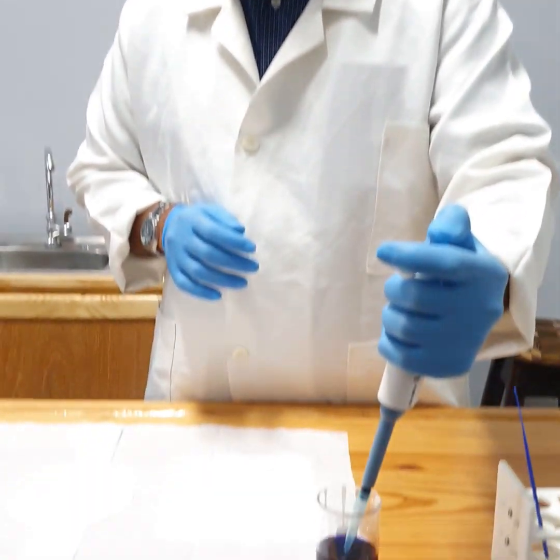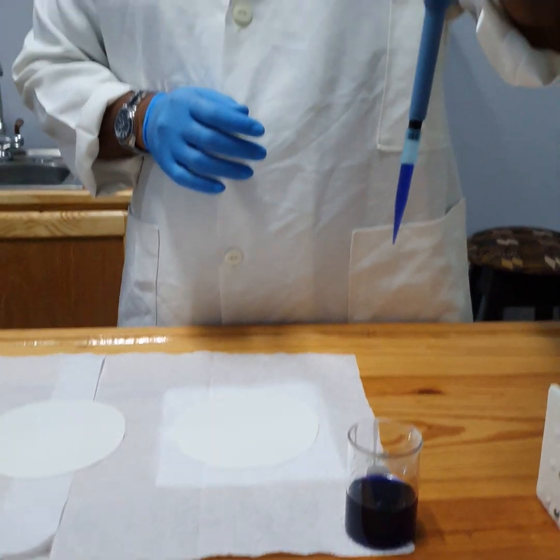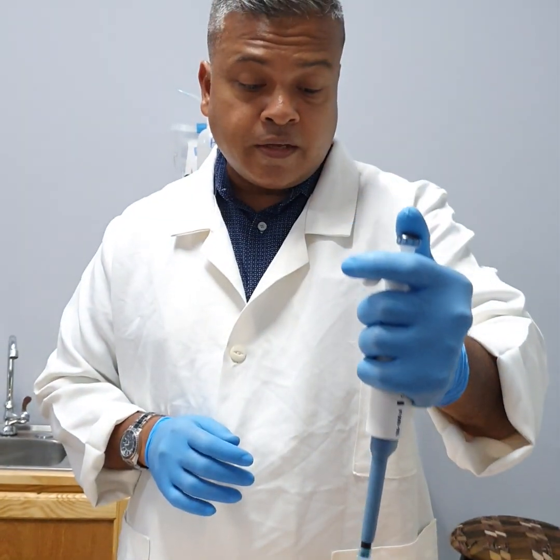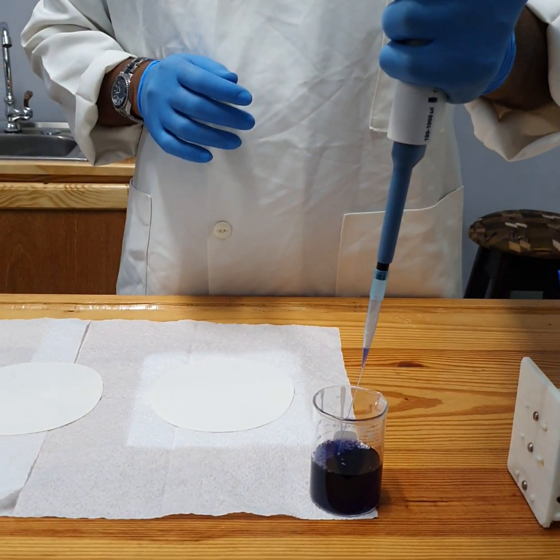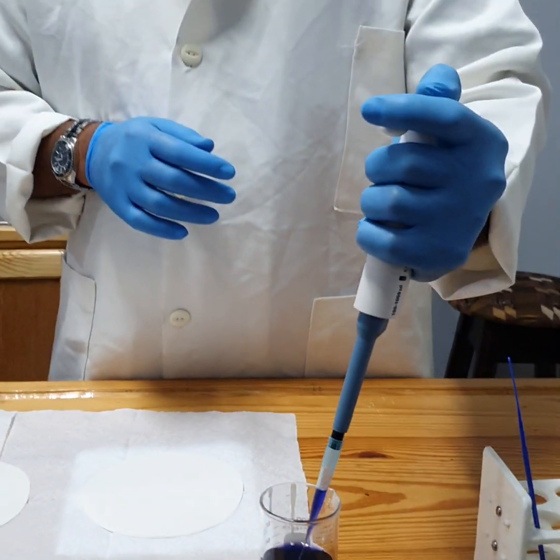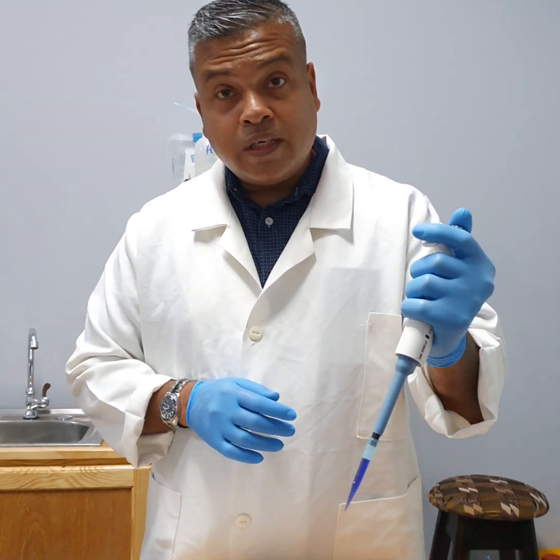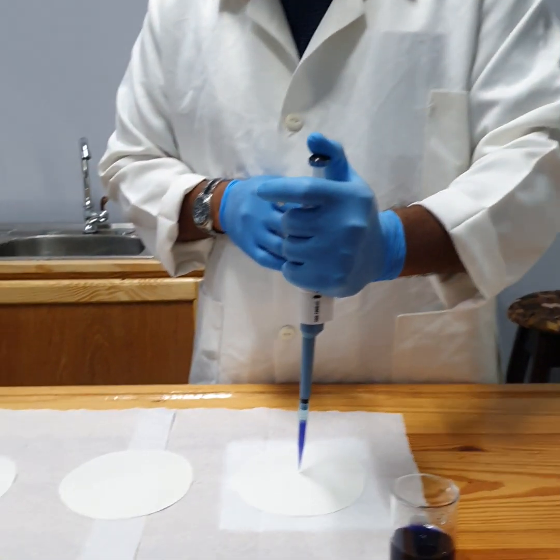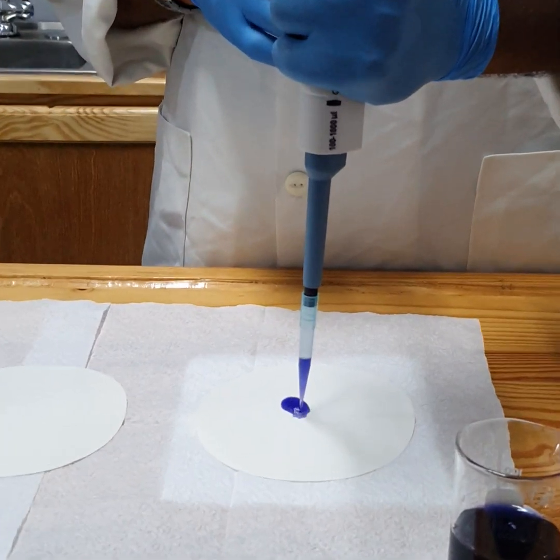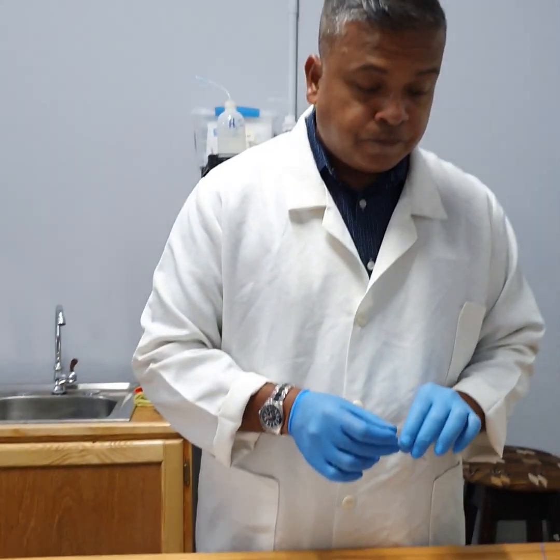And I'm just using a safe colored reagent here. This is what 1 milliliter looks like, and I'm going to dispense it here. This is what 1 mil or 1 milliliter looks like. 1000 of this is 1 liter, and I'm going to dispense what 1 mil looks like here for us to appreciate that. Now that's 1 milliliter.